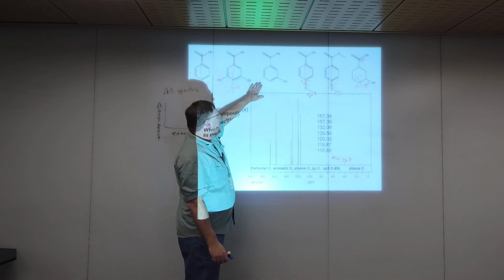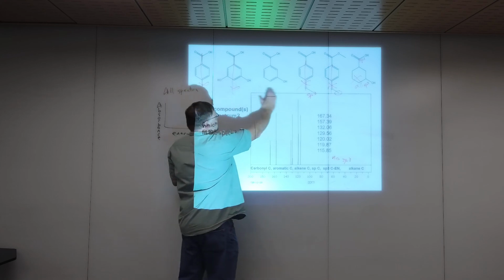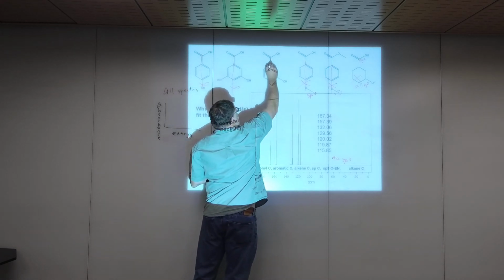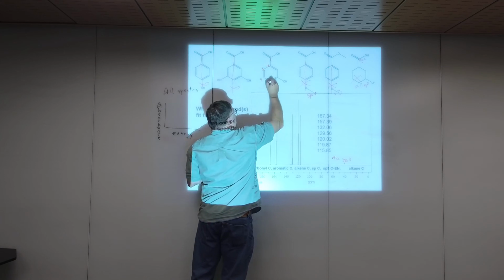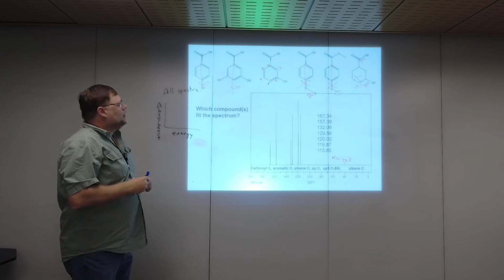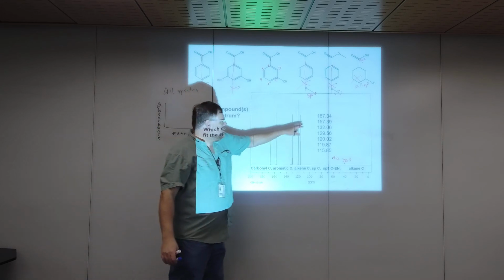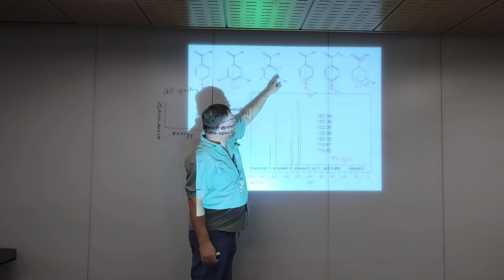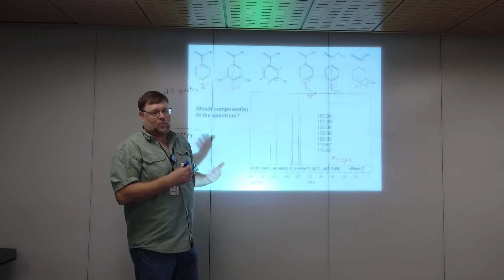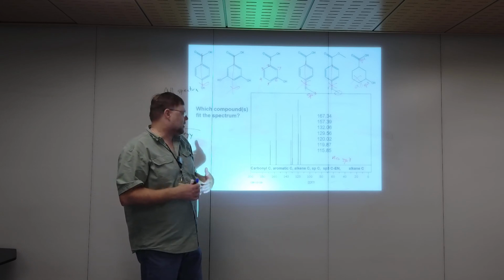So here you go. How many carbon signals should we see there? No plane of symmetry. Well, there's a plane of symmetry through the board, but not overall. So there's 1, 2, 3, 4, 5, 6, 7. There are 7 carbons. Got a carbonyl carbon, 167. That's carbon 1. The benzene carbons, there's no way at this point for you guys to differentiate which one is which, but they're all different. All 6 of those benzene carbons are different.